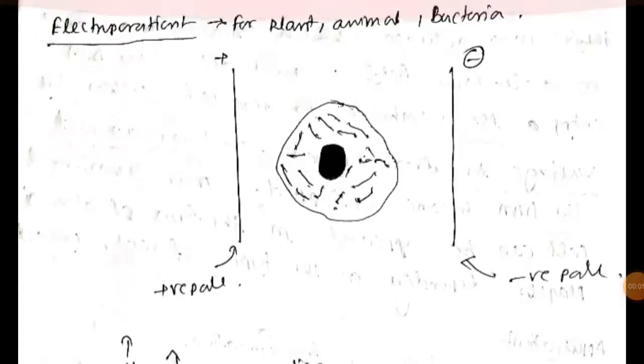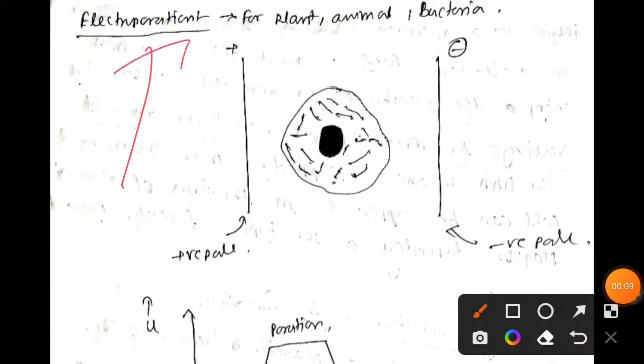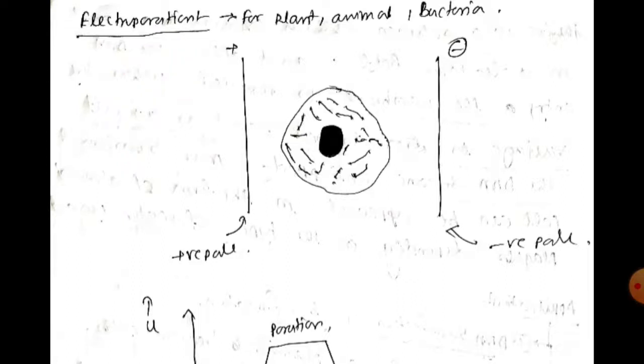Okay, so this is all about the lecture video on electroporation, a gene delivery method that we can use to transfer plant cells, animal cells and bacteria. So first we will learn about the instrumentation.